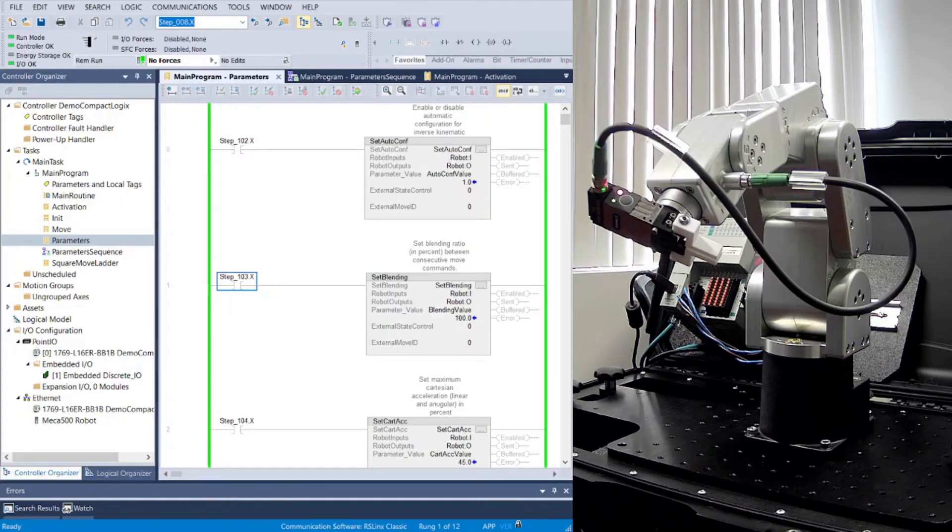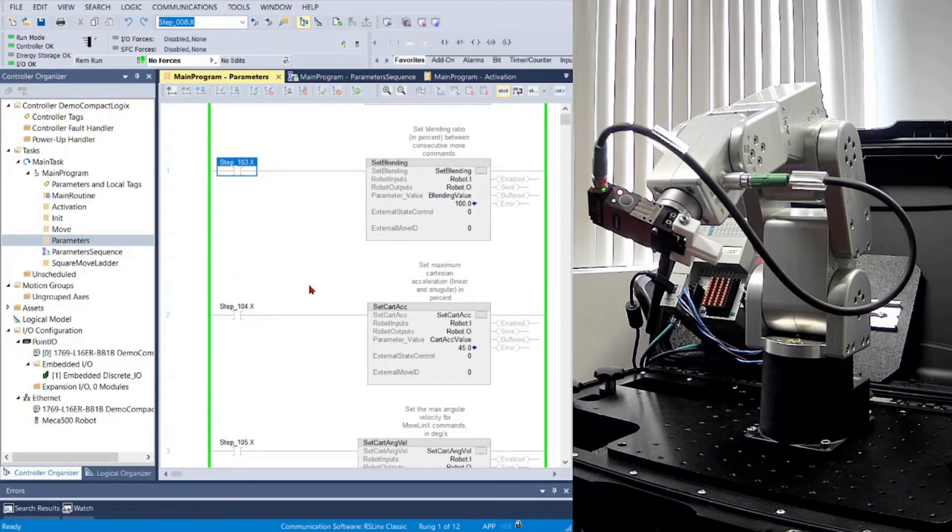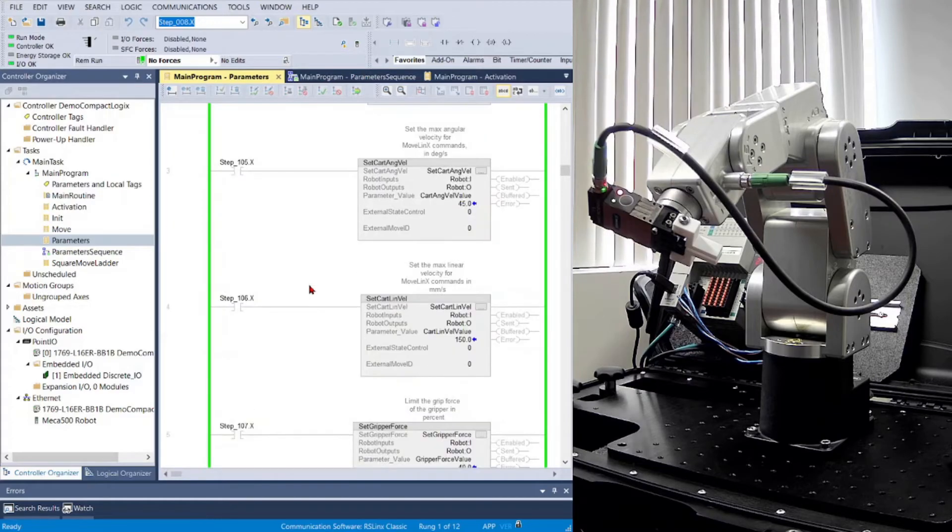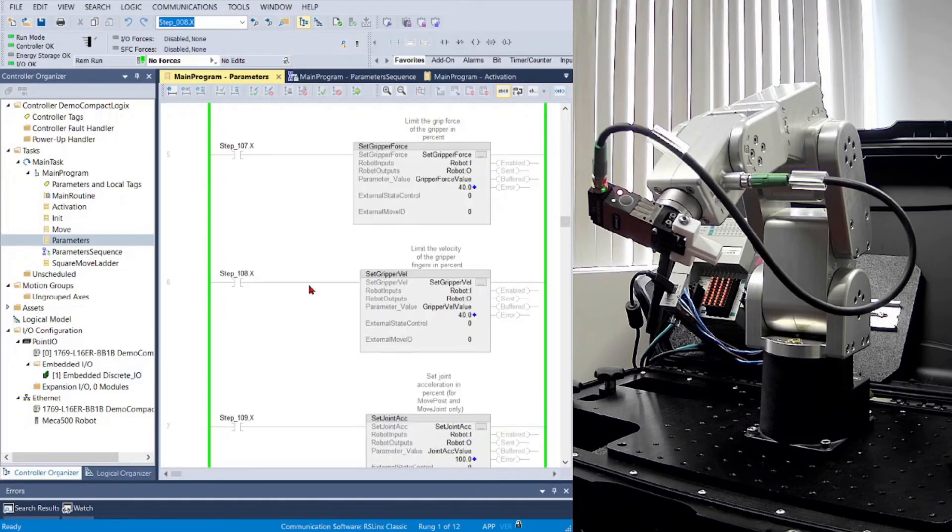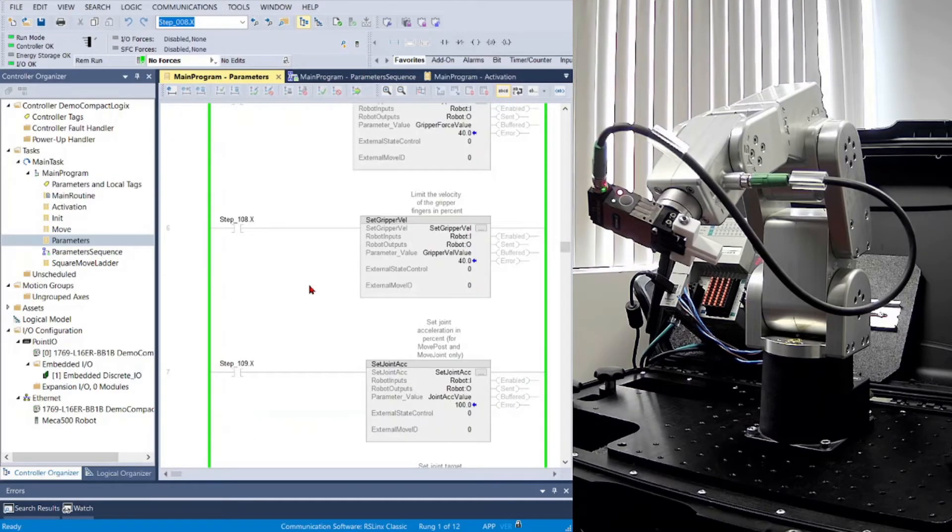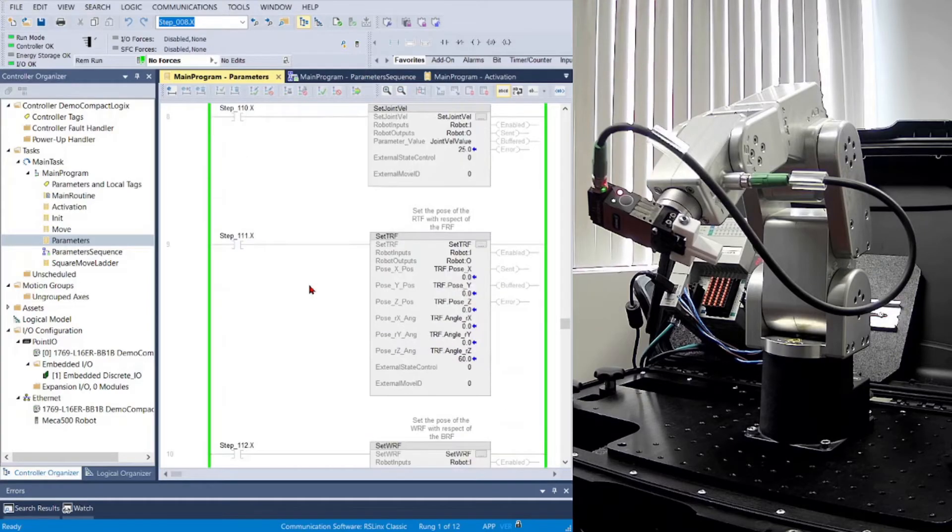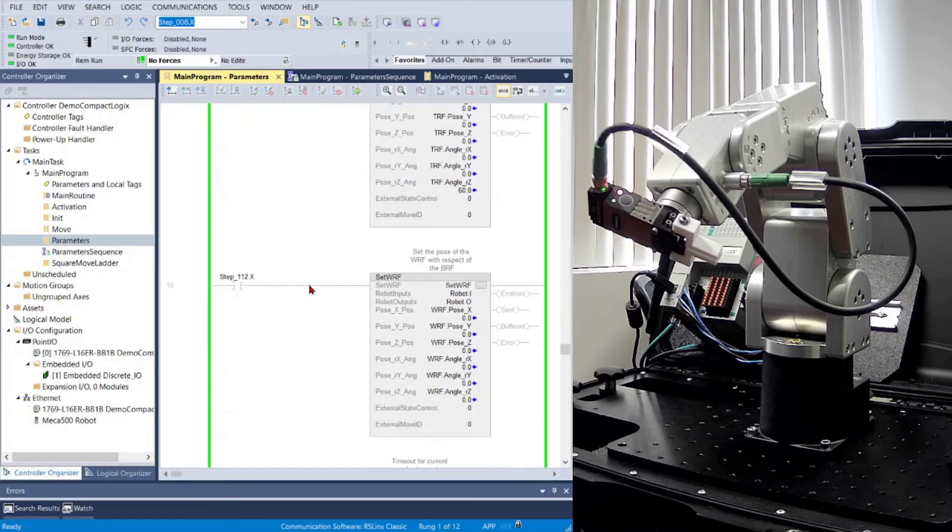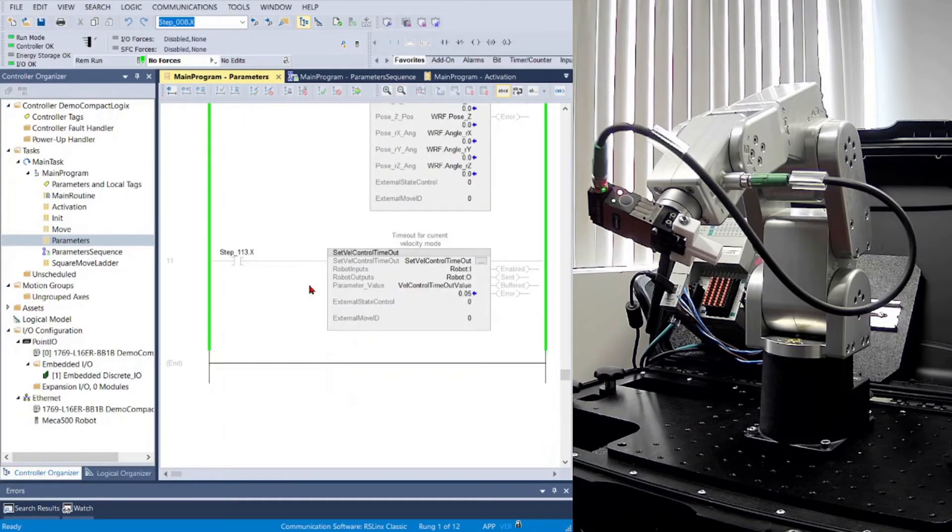MECADEMIC has provided an AOI for each of the parameters that you might wish to set. In their example program, all of the parameters can be set at once by using their sequence. Parameters that would normally be grabbed by a GET function are updated continuously.